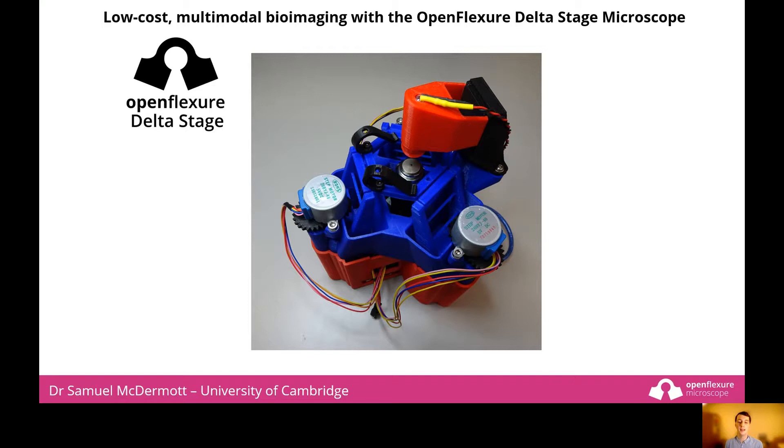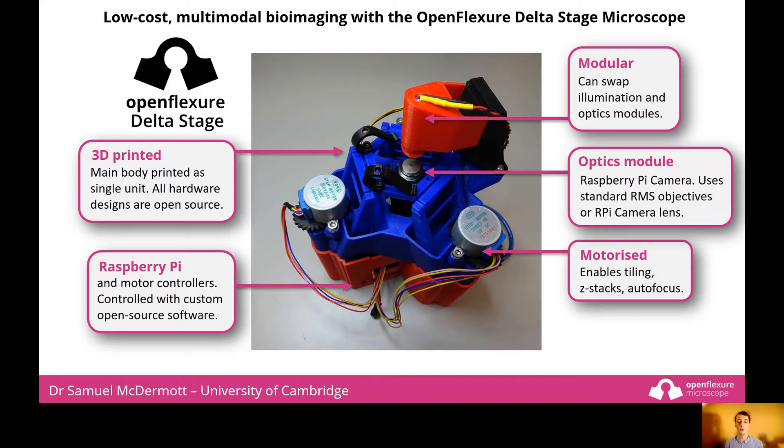You may be familiar with the OpenFlexure microscope, which is already starting to make an impact around the world. Here we present the OpenFlexure delta stage, a variant of the OpenFlexure microscope. Its low cost and small size make it suitable for a researcher to have on their lab desk or in an extraction hood.